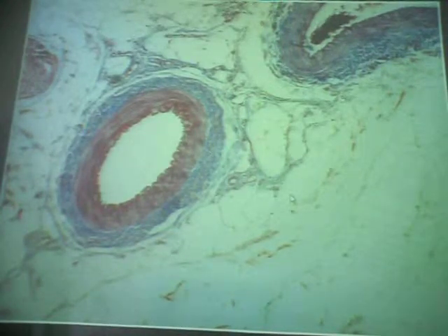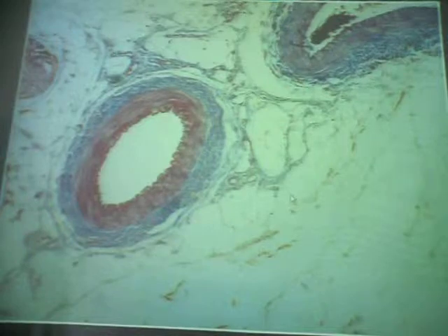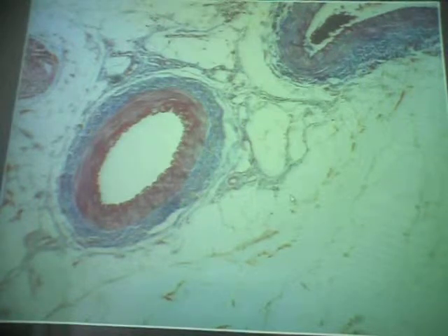All blood vessels are lined with what kind of tissue? Simple squamous epithelium. That's part of the tunica intima. All right? We can tell simple squamous because it's a single layer of flattened nuclei. That applies to all lower blood vessels. Capillaries right to the largest veins and arteries.